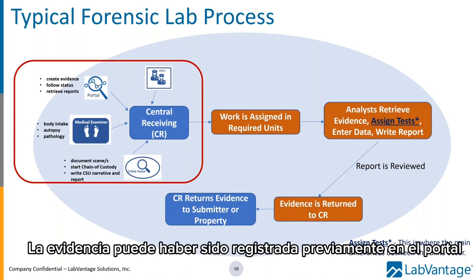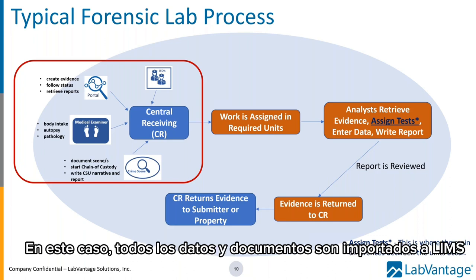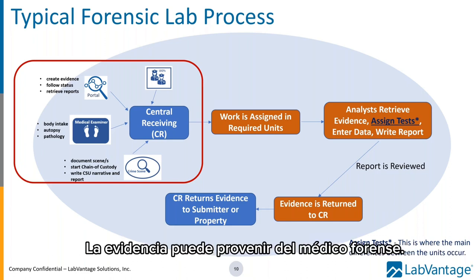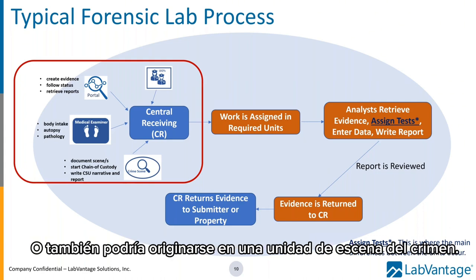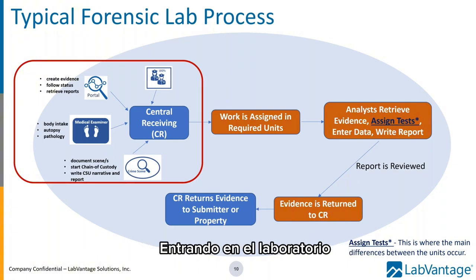The evidence may have been pre-logged in the portal, as we mentioned, in which case all of the data that's already been documented in the portal will be imported into the LIMS. The evidence may come from the medical examiner, or it could also originate from a crime scene unit. So these are all sources of evidence entering the laboratory.